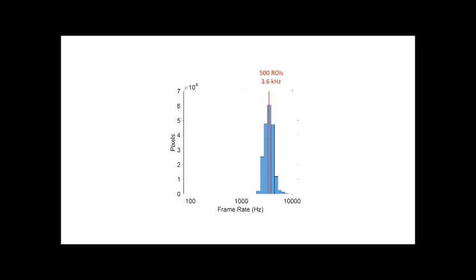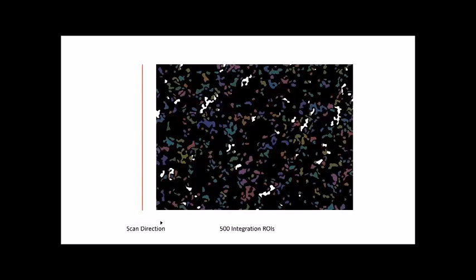We built a previous microscope that shared a lot of the same concepts, but it measured different regions of interest simultaneously, like all the regions of interest along a line together. That microscope required computational unmixing and very specific calibrations. You had to know exactly where the line was at any given point in time, which made the processing of the data laborious and time consuming. With this microscope, you can just see the images as fast as you are recording them, because for the photons that you collect at any given time, we know exactly where to assign them in the field of view.